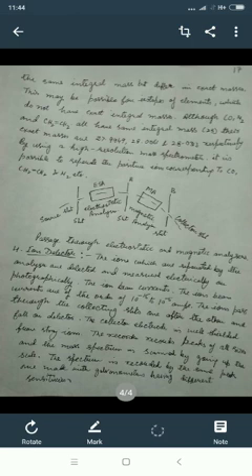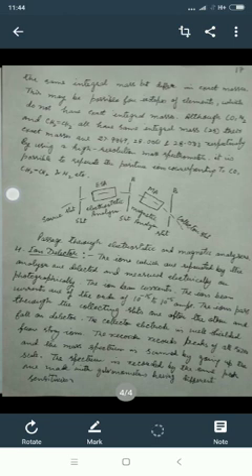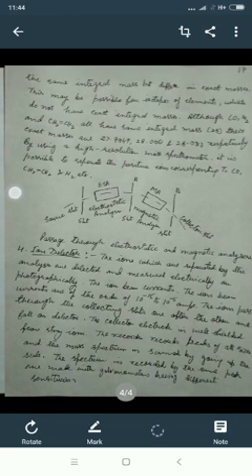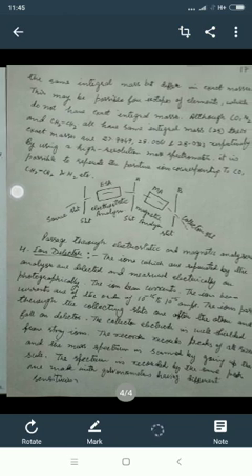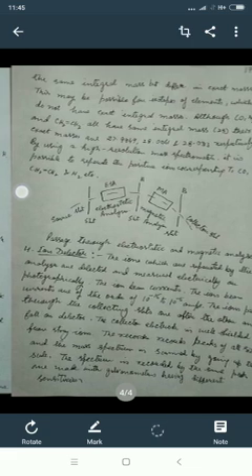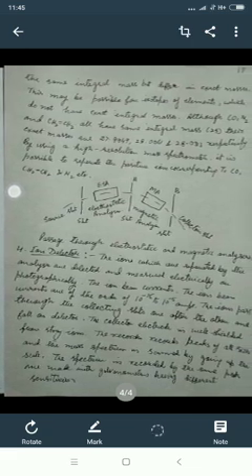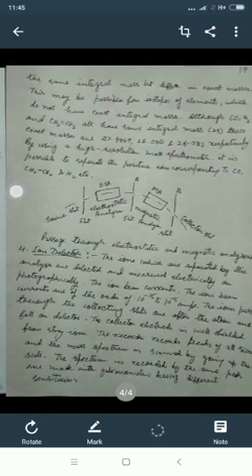In the diagram you can see the source. There is a slit. Through the slit the electrostatic analyzer will analyze the ions. Again we have the A slit and then the magnetic analyzer. So it is double filtering, and then the B slit, through which the ions will be collected in the collector, after passing through the electrostatic and the magnetic analyzer.